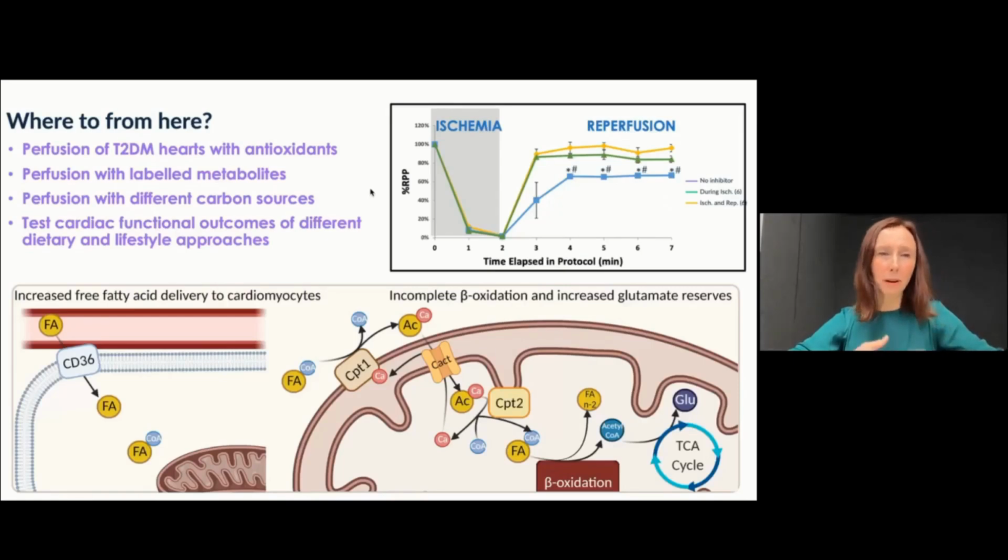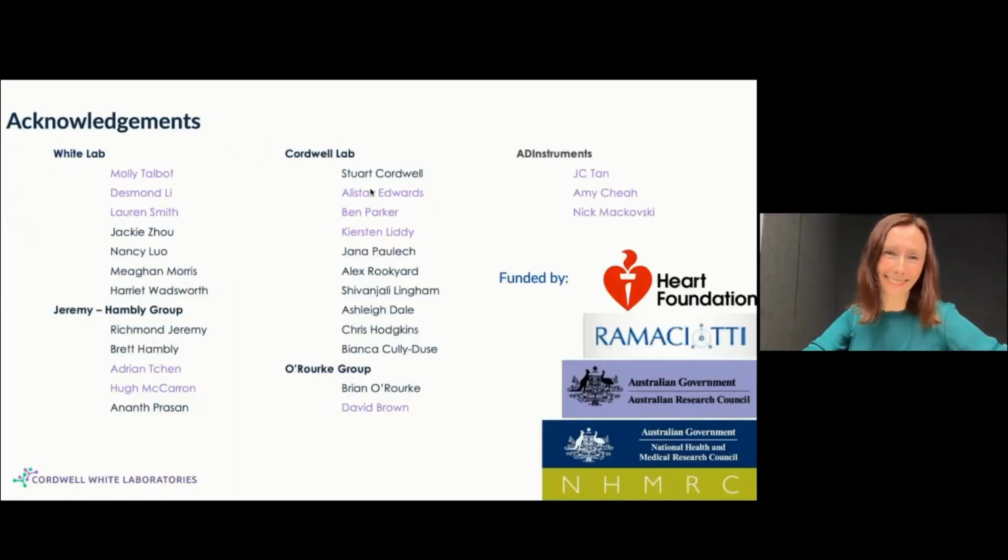So in my lab, where are we going? We are moving to treat diabetic hearts with antioxidants. We're going to be using our new AD Instruments system to infuse hearts with labeled metabolites to do some fluxomics and perfuse our diabetic hearts with different carbon sources.